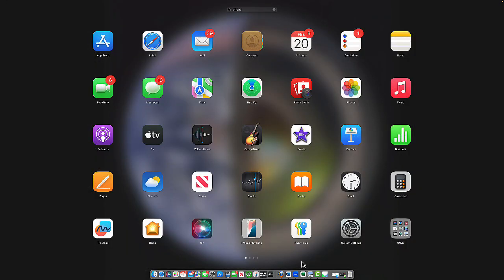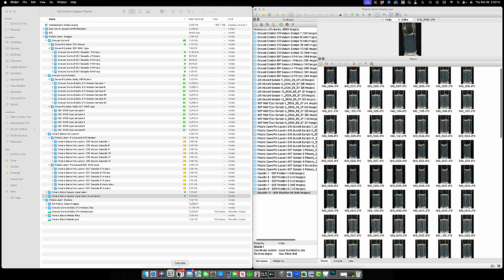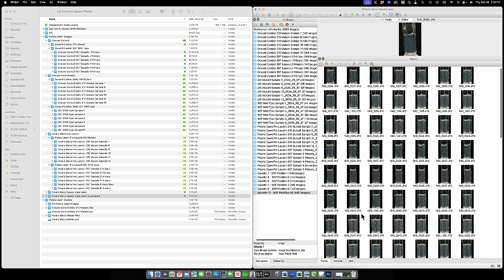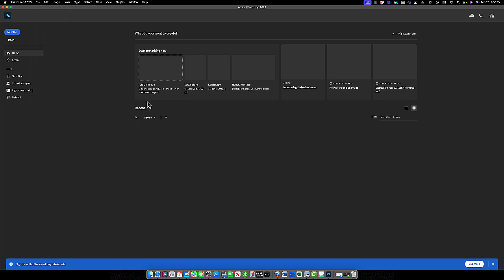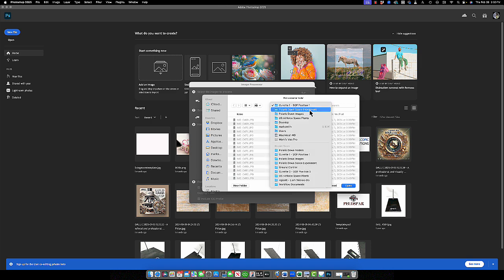We're going to open Photoshop back up, and we're going to navigate to scripts, which is how we're going to be able to apply the edits to all of the individual images. Okay, so File, Scripts, and Image Processor. Okay, so this was the root isolation under Polaris Dawn Edit, so I have that down here in my Run action. I need to select the folder, which is that duplicate folder that I just created.